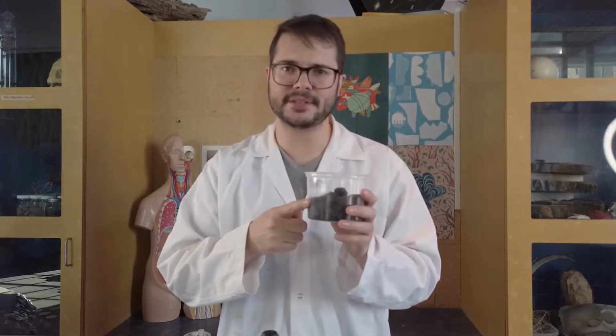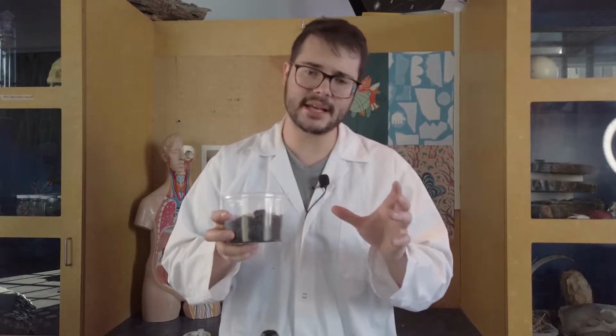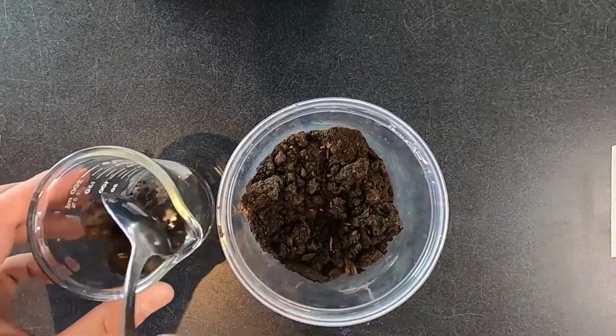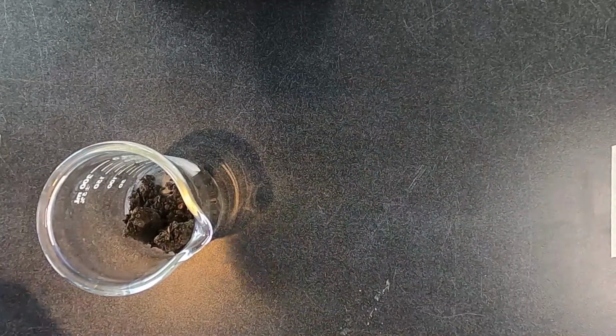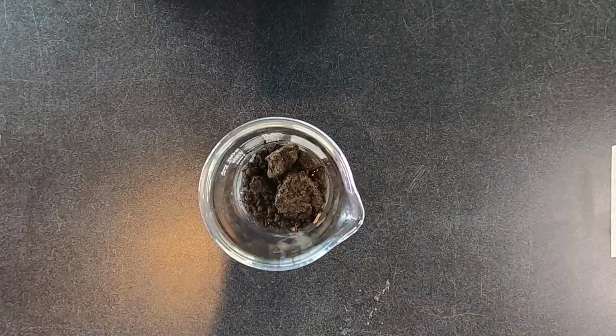Science Center. Now, this container is filled with soil I gathered just from outside, and to gather a really good sample, I dug down about 10 centimeters into the earth and collected all of this. So, from here, we're going to take a tablespoon of this soil and we're going to put it into a clean beaker. There we go. We're going to move all of our extra soil out of the way there. We just have our 1 tablespoon there.